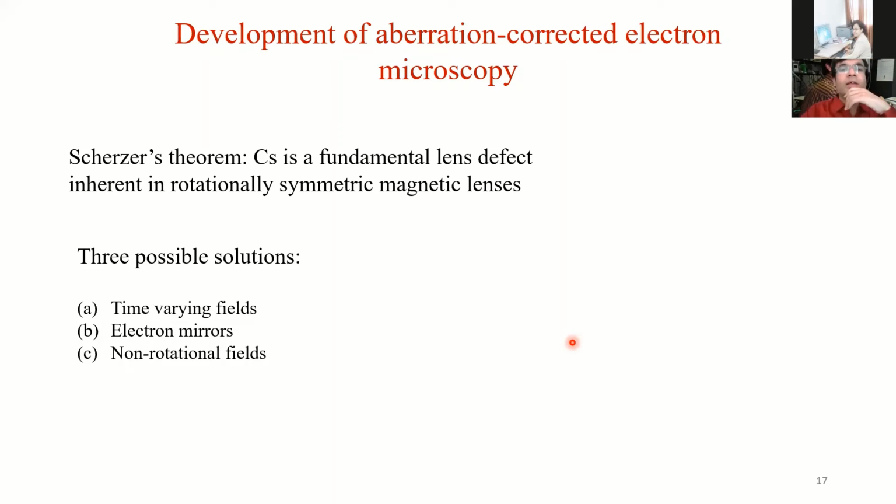So then, why do we need aberration correction? Because we are using high voltage electron microscopes, but there are a lot of problems with them. The main problem is radiation damage. You're using an extremely energetic beam, and that energetic beam can probably damage your sample significantly. That can lead to some artifacts, or can compromise the resolution, and that's not desired. Another problem is the stability of the electromagnetic components. You are working at very high voltage, so stability of the electric components is important.